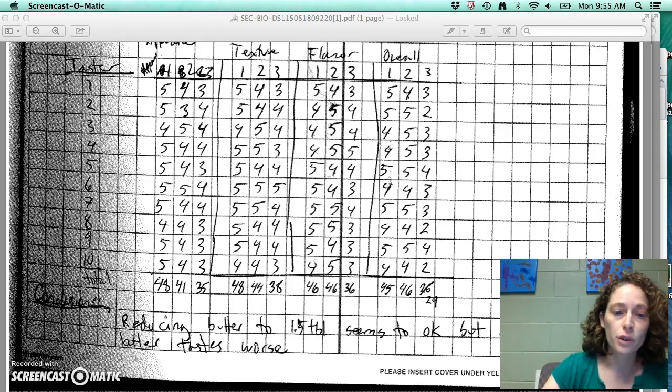So whatever you learn from your experiment, even if it's a giant failure, you usually learn something, right? We killed all of our worms, we think most likely by taking too long to wash them, right? Something like that. So always write what you learned from the experiment, what you're thinking of doing next, things like that.